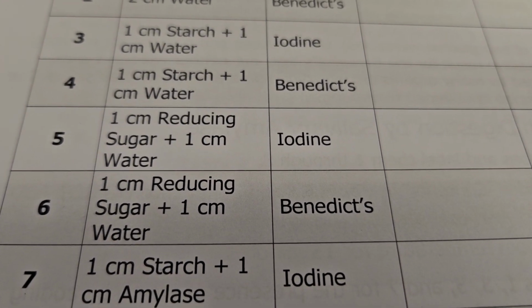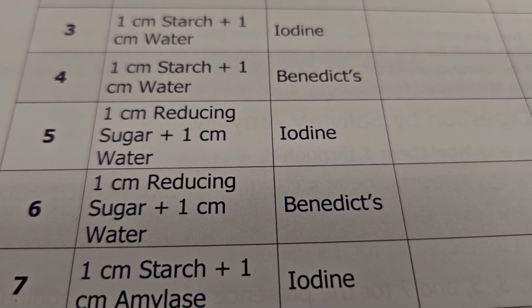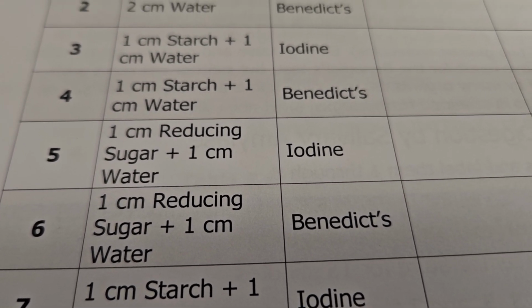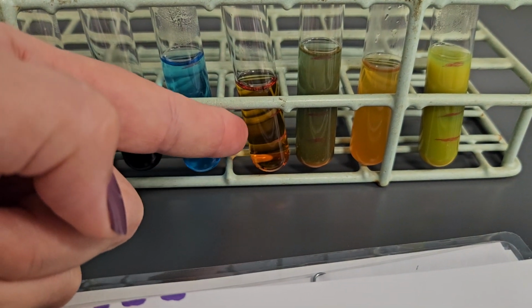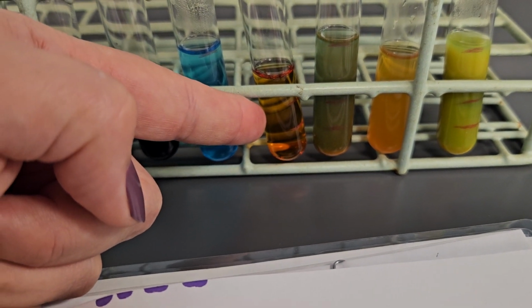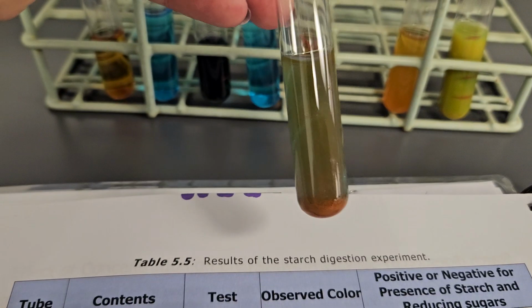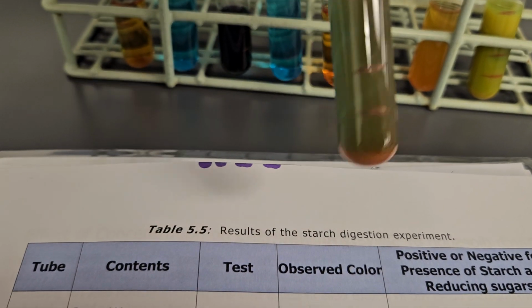For 5 and 6, we tested reducing sugars with iodine and then with Benedict's. So we're basically making the same test tube, but testing it with 2 different things, which we can't do in the same test tube, so we had to make 2. All right, so here we are at test tubes 5 and 6. We were negative for starch with test tube 5, but positive for reducing sugars. This test tube has sunk a little bit, but it's definitely positive in that orangey green color for reducing sugars.